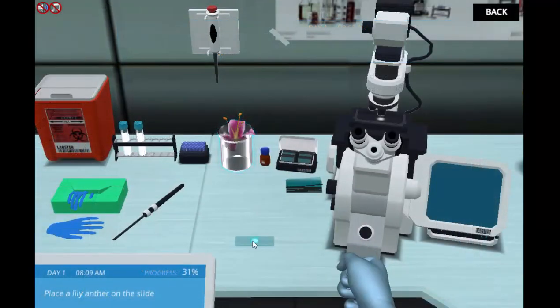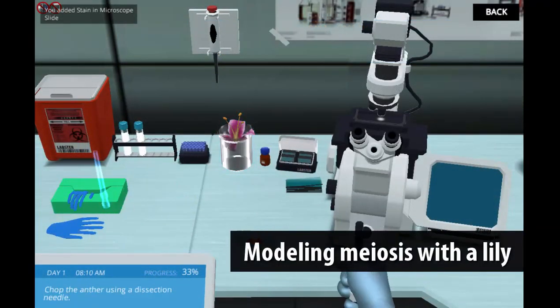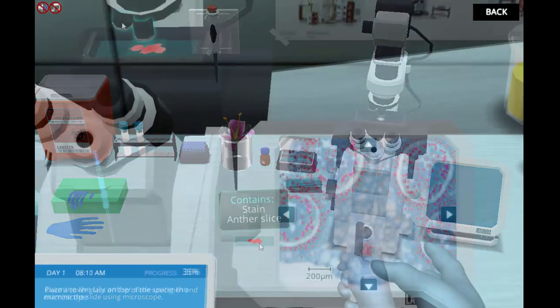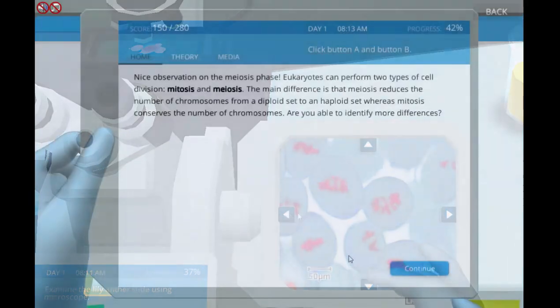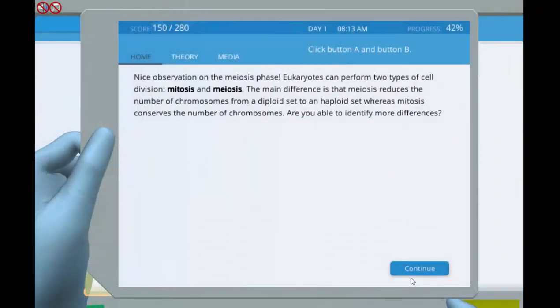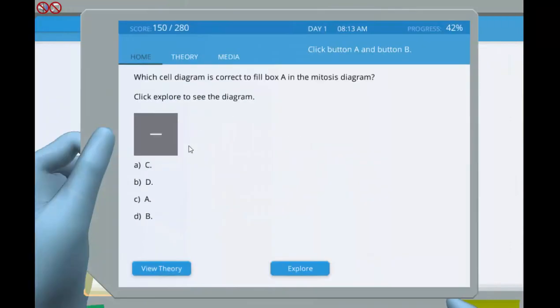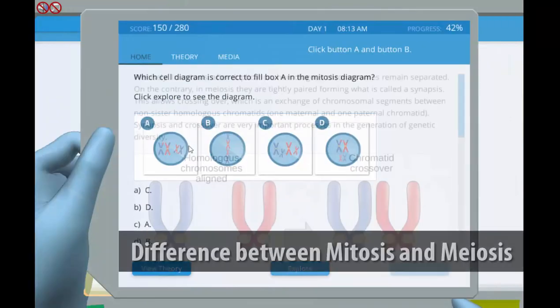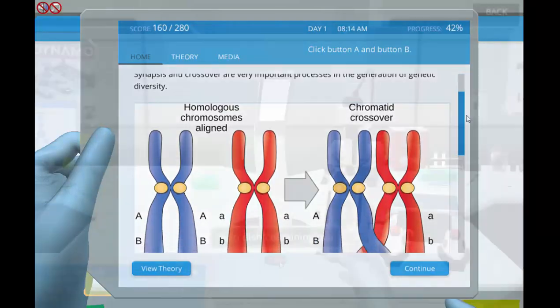Students will also use a lily as a model organism to observe the stages of meiosis and their characteristics. Both mitosis and meiosis are types of cell division, and in this lab, students will learn the differences between them.